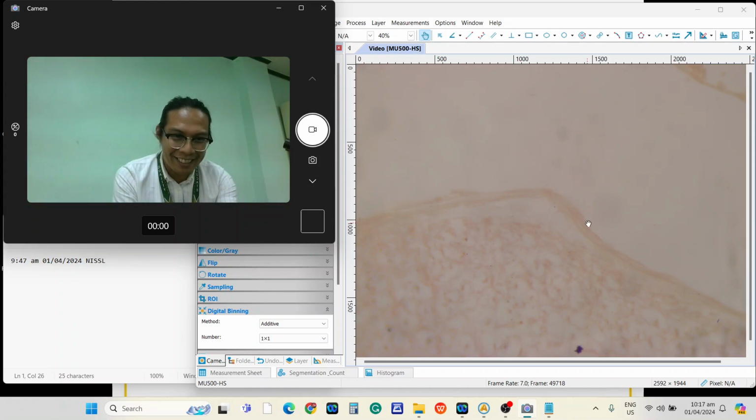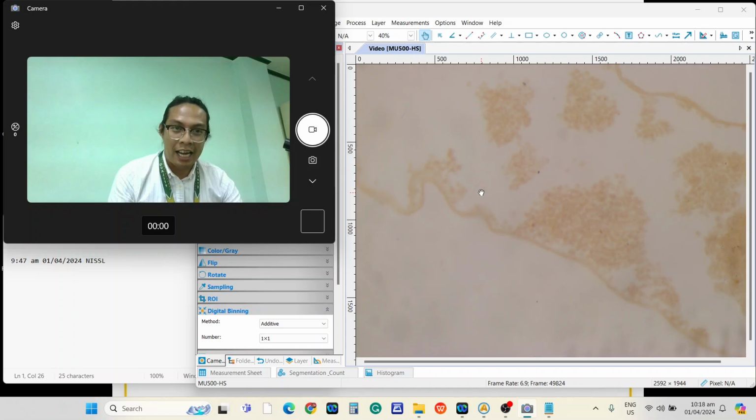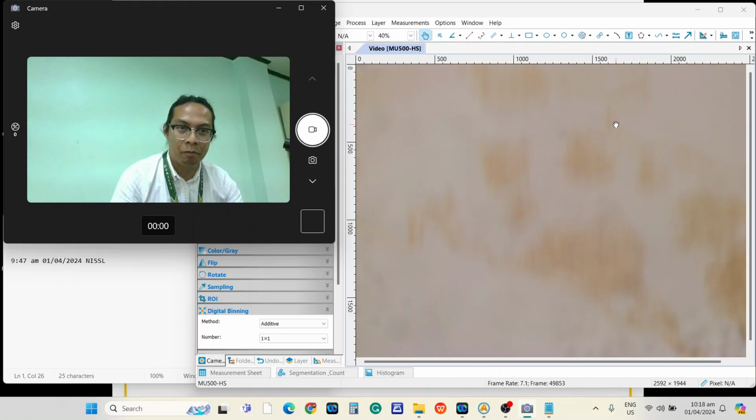Okay, so that is the pia mater. Okay? So as you can see, it is again a connective tissue covering of the CNS. Review. So that is the pia mater. Moving on outside, that is the arachnoid containing the blood vessels. Nakikita natin yan, mga blood cells yan.